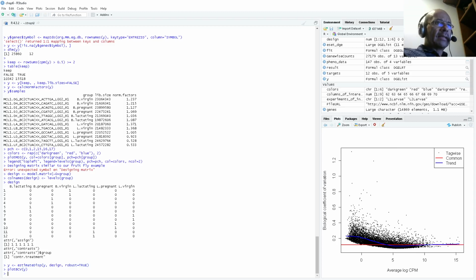As we analyze the data, we observe a low biological variation coefficient, indicating that gene points are closely clustered. We can extend the negative binomial model with quasi-likelihood, as seen in our fruit fly example, to describe general variability across all genes using the glmQLFit command.